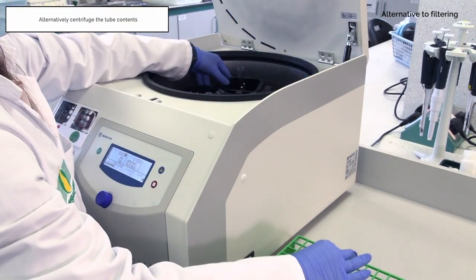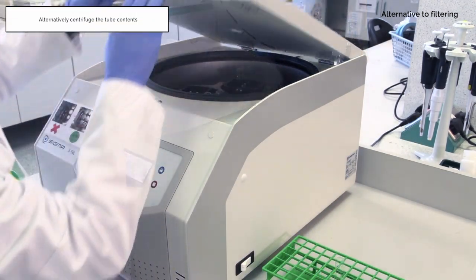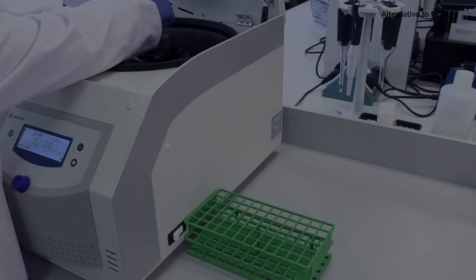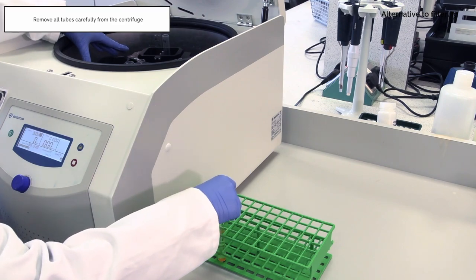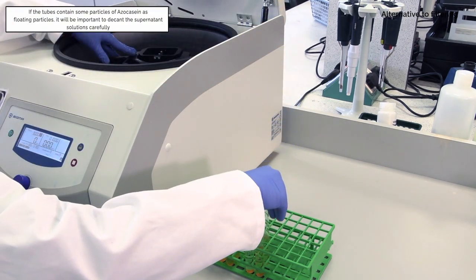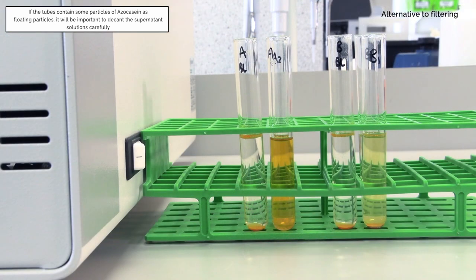Alternatively centrifuge the tube contents. Remove all tubes carefully from the centrifuge. If the tubes contain some particles of azo casein as floating particles, it will be important to decant the supernatant solutions carefully.